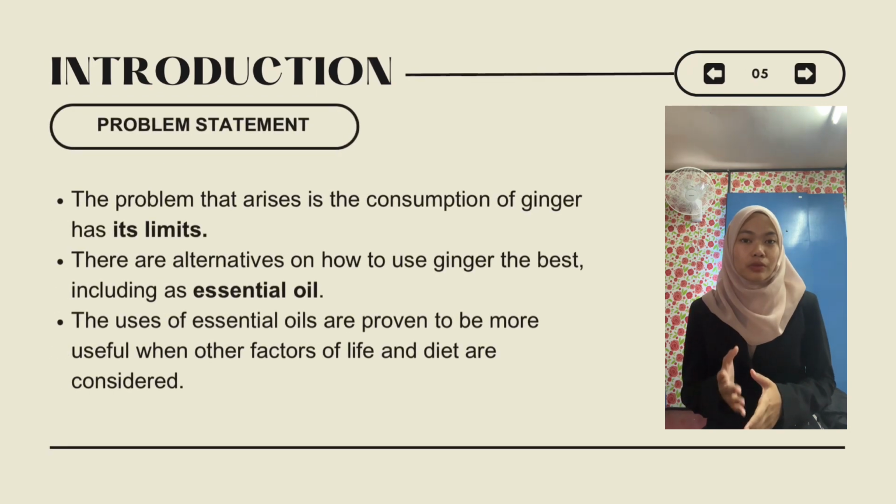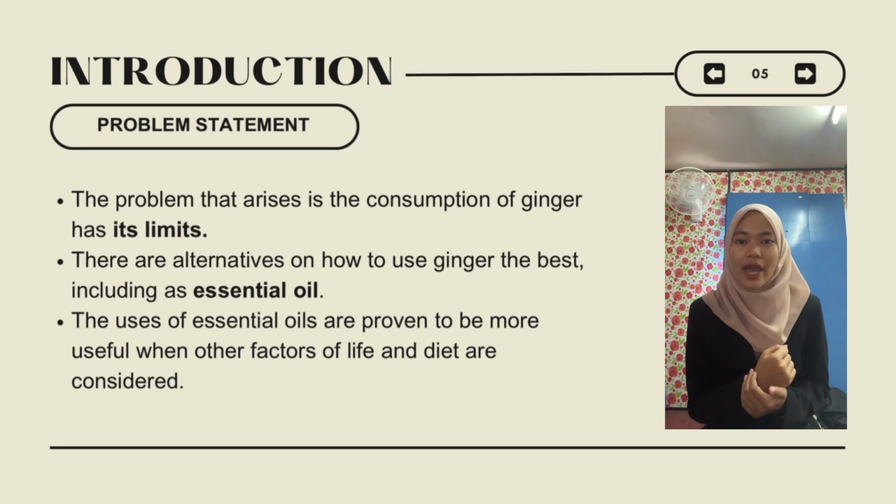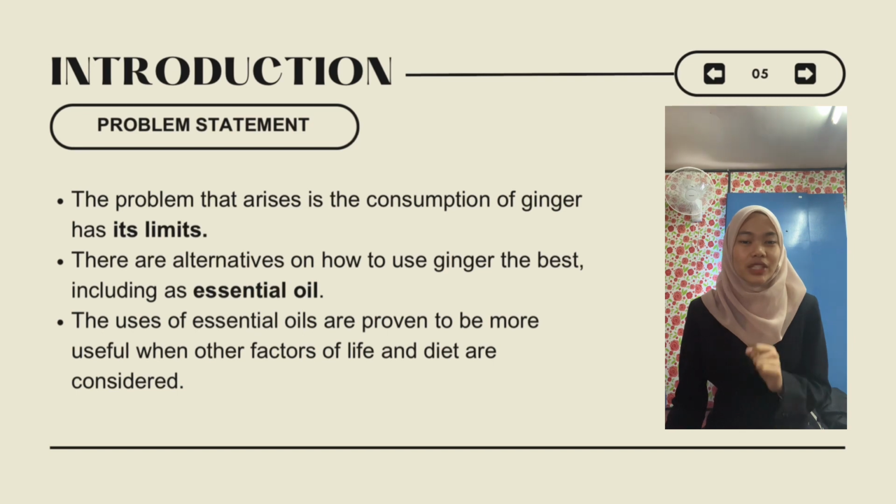Ginger is one of the most common home remedies. The problem arises when ginger's consumption has a limit. For instance, not everyone can take ginger in their diets as they might get heartburn or gastrointestinal issues. So, in order to avoid it, the best way is to extract ginger into essential oil, which is more convenient. However, is ginger in essential oil form safe for daily use? Thus, an approach to prove its toxicity is made in this study.